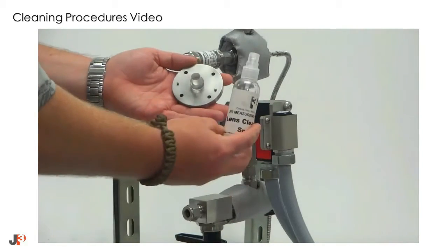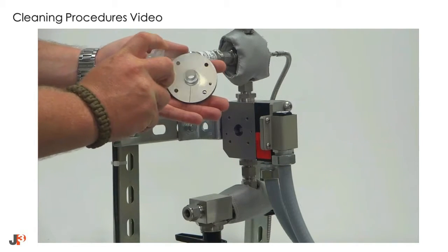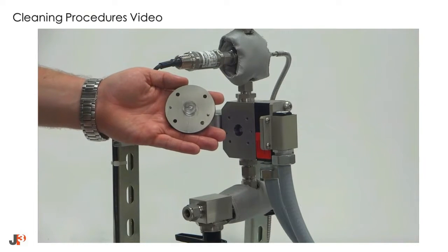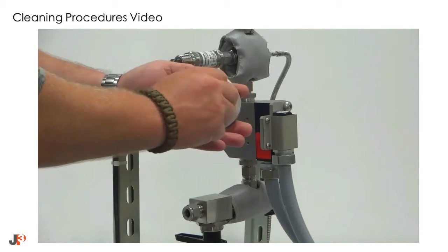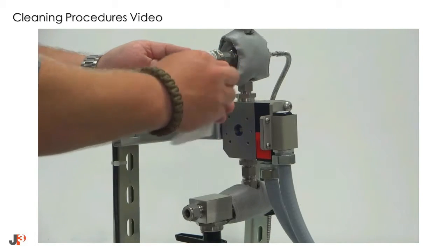Also, before reinstalling the flanges, ensure that you clean the optical sapphire. Use a couple of sprays of the JP3 lens cleaning spray and the lint-free cloths to clean the face and area around the main optic.